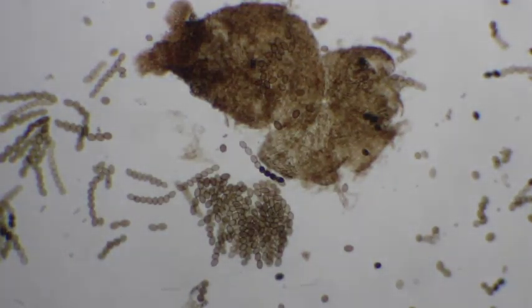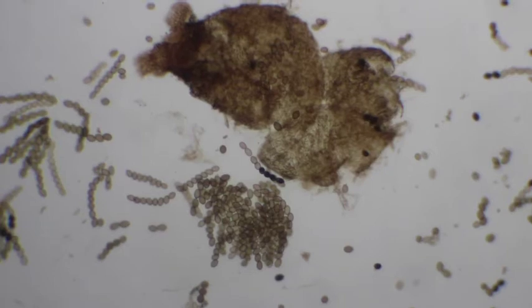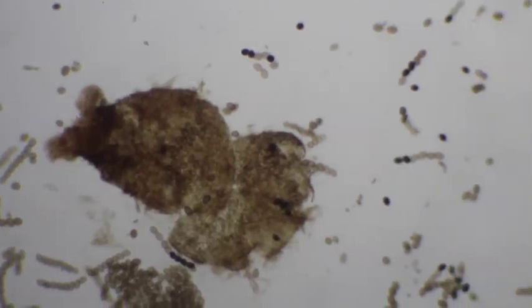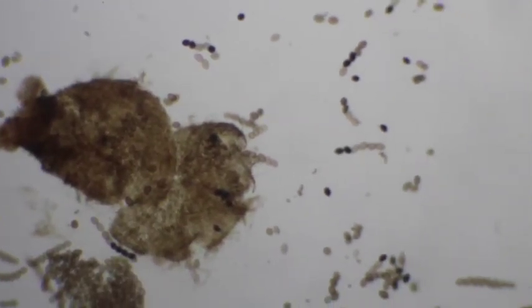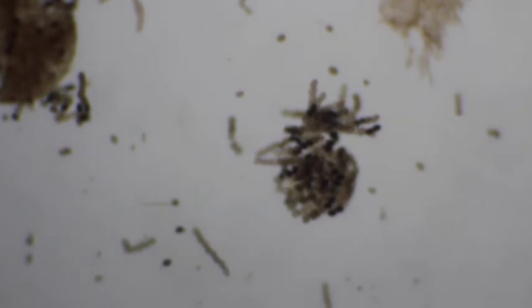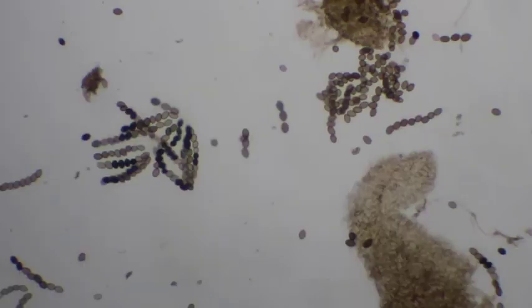Unfortunately, in this particular one, we only have one really good one, 4 and 4. And so what I'm going to do is I'm going to look around, and then we'll spot groups of 8 where we can get a nice group of 4 and 4. So that one was looking good, except it only has 6. There's one with only 2. So not great. Now we're going to search around some more. And so I'm going to click this off, find some, then we'll focus in as we find them.